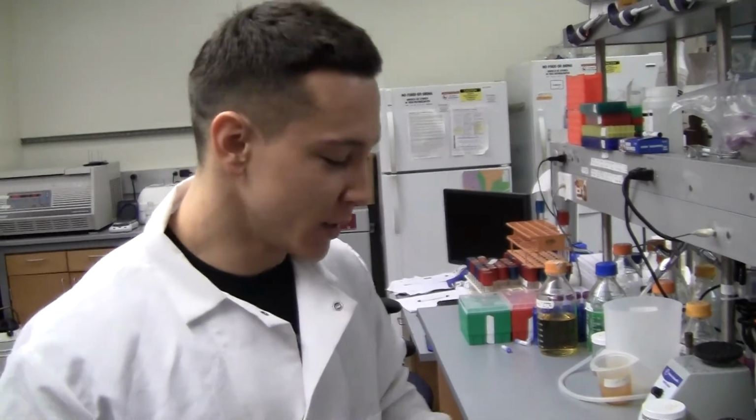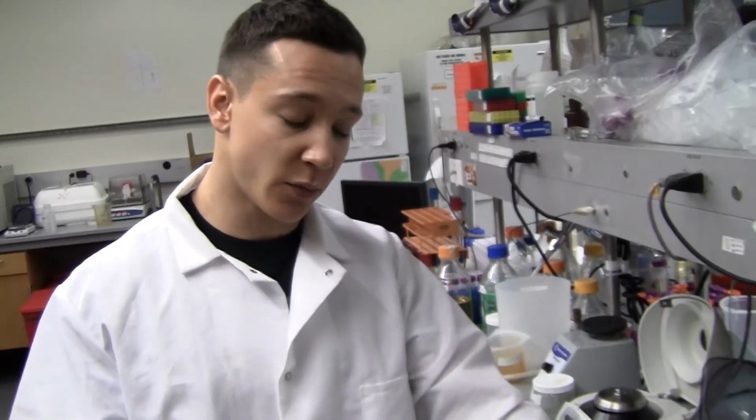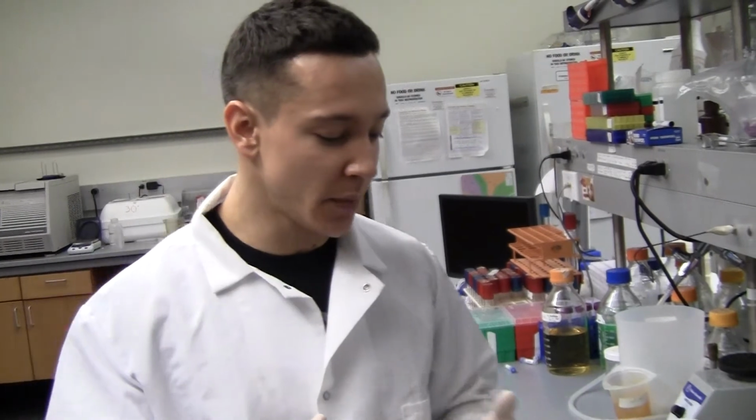It doesn't want any other phages coming in messing up its party. So the idea is if we put this T4 IM gene in these four strains of E. coli, then we subject that E. coli to T4, hopefully, if that IM gene is there, these E. coli should live. That's the idea.